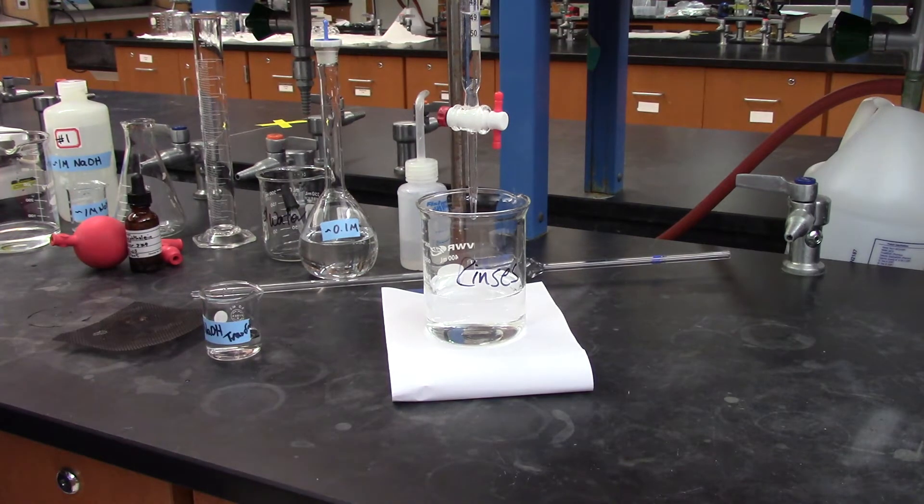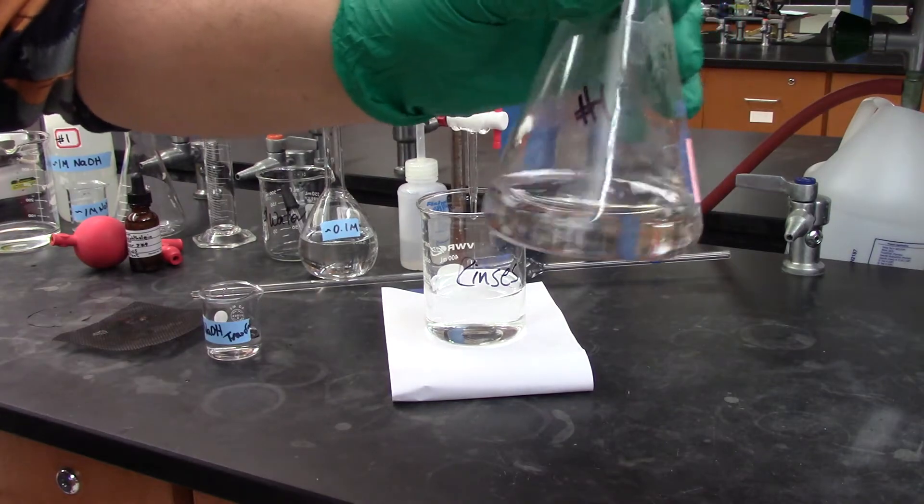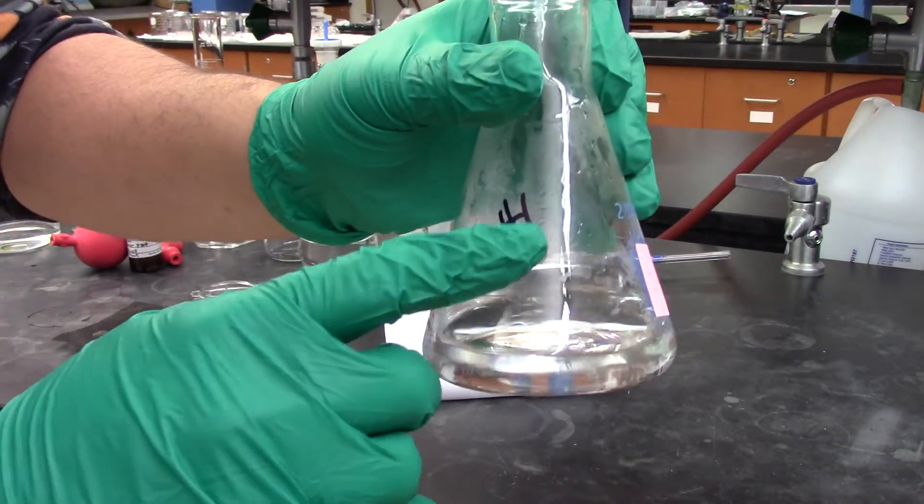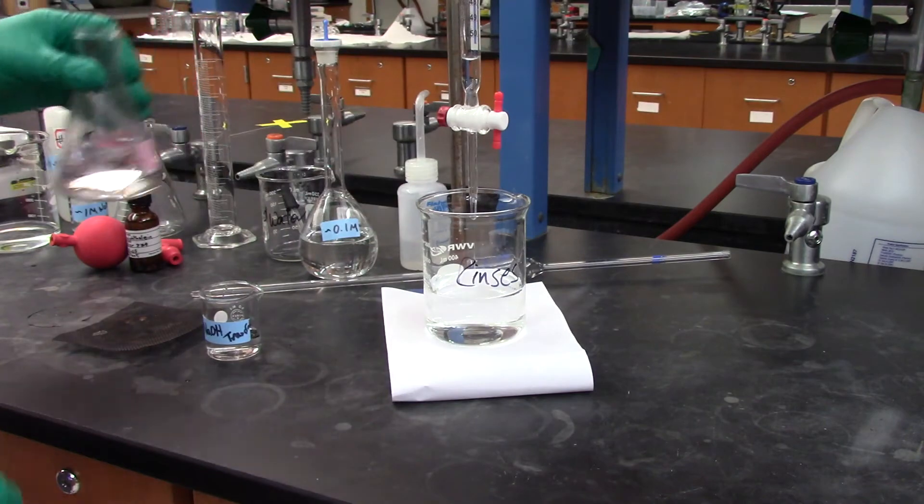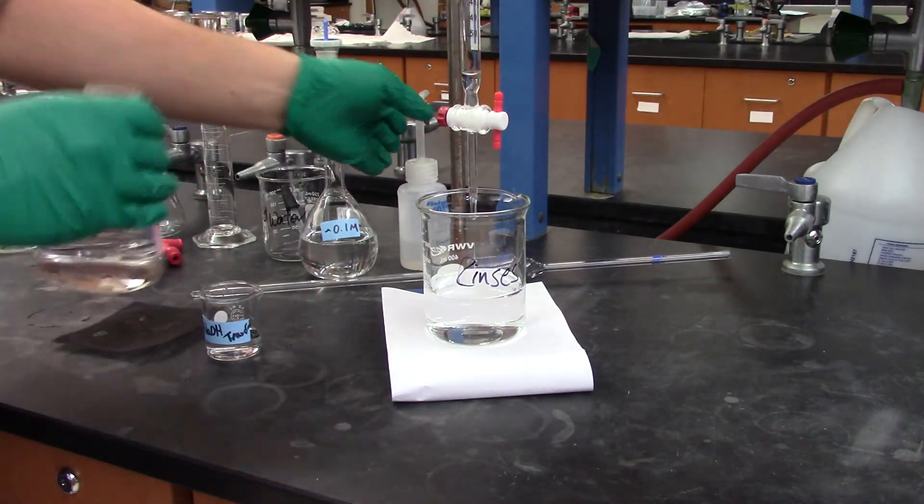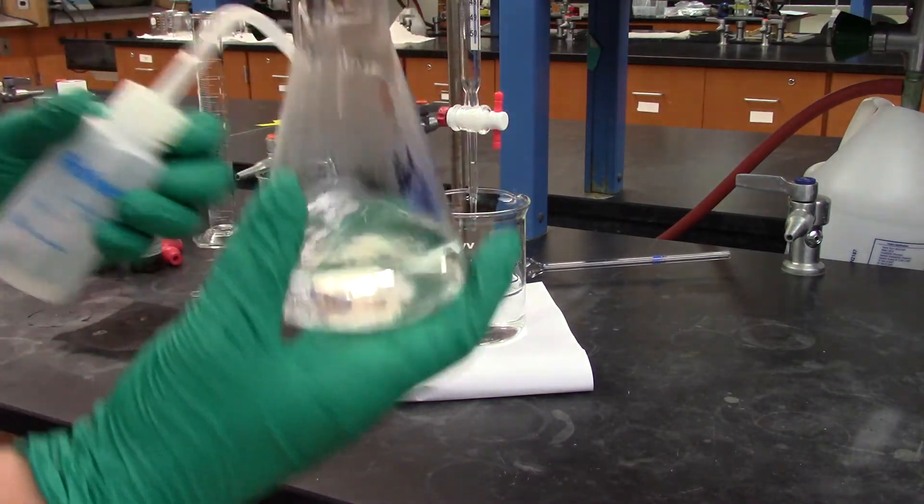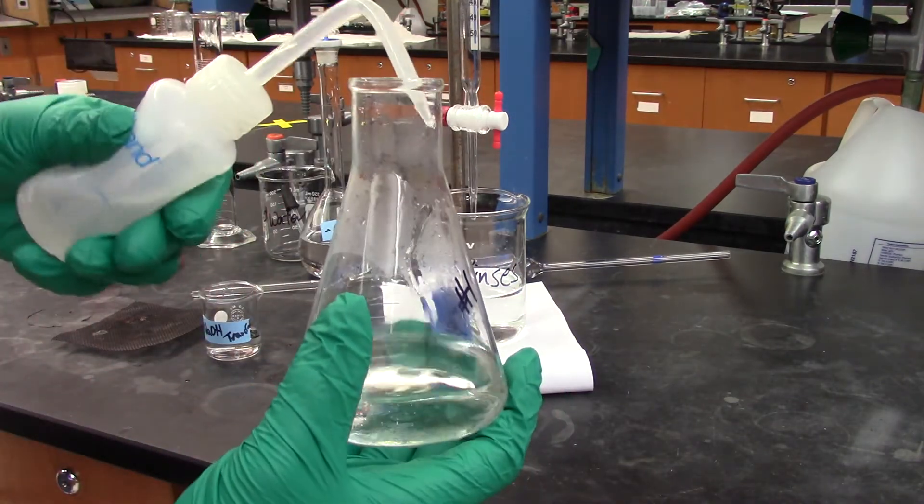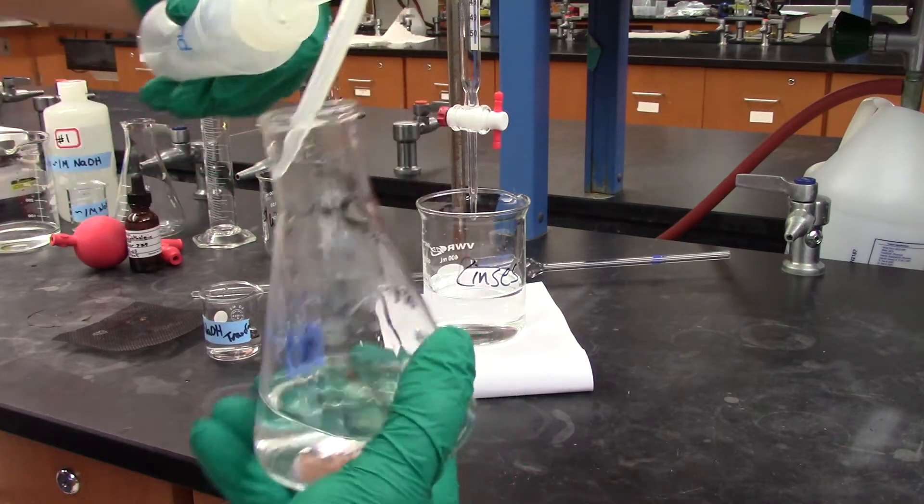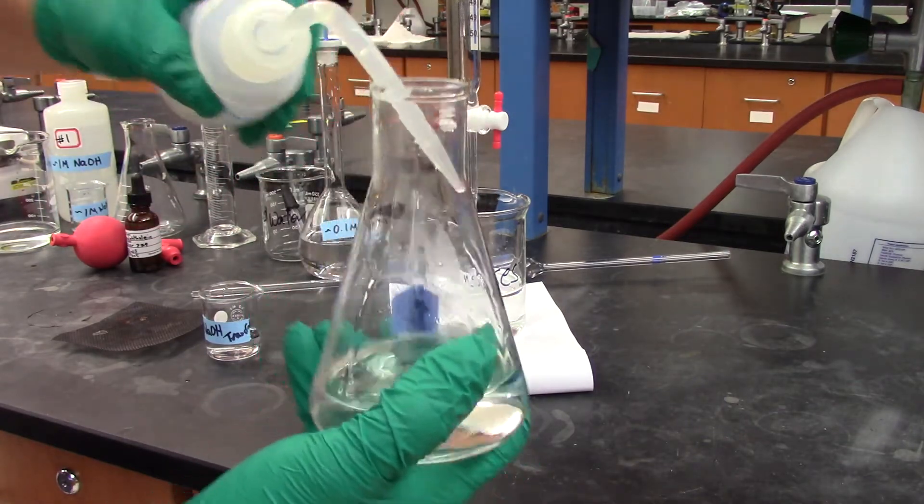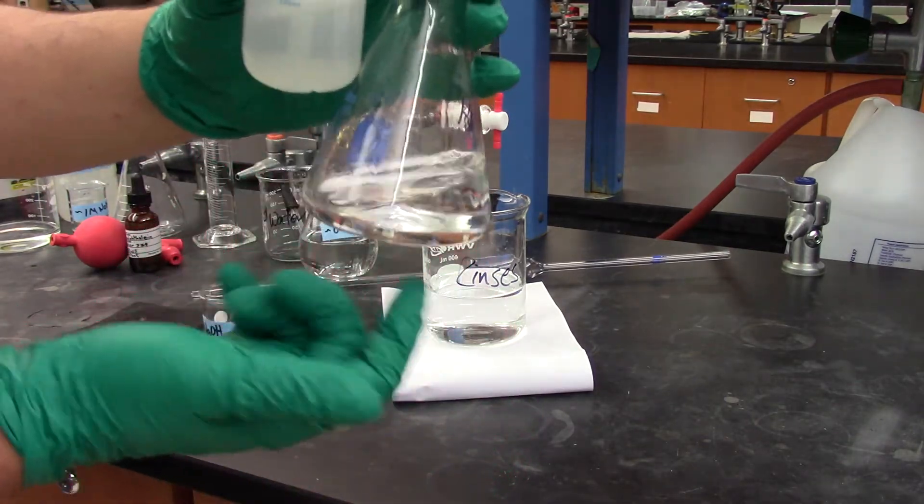My flask looks pretty good. All the KHP looks dissolved. I labeled it number one. It's important to rinse the sides of the flask before you begin to get any KHP down into your titration solution.